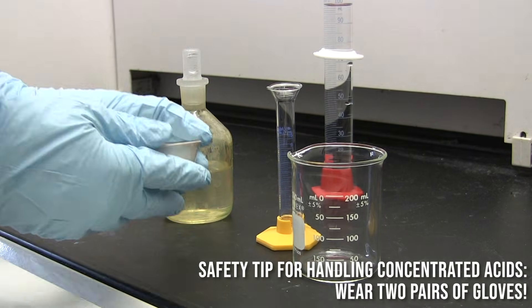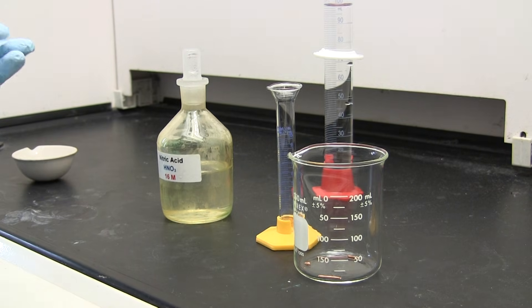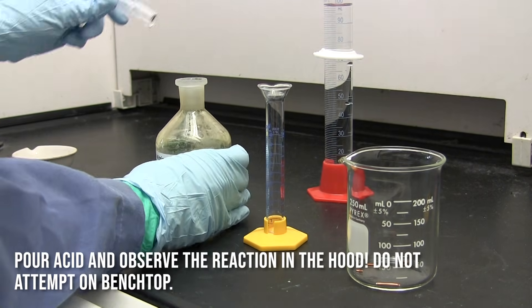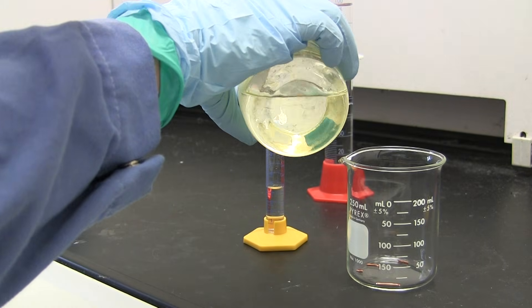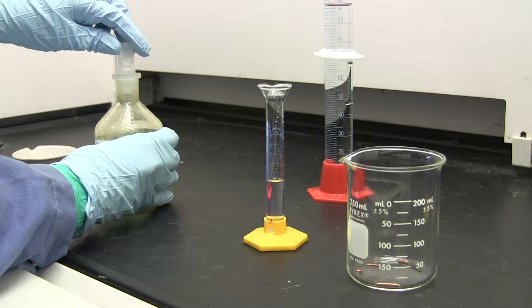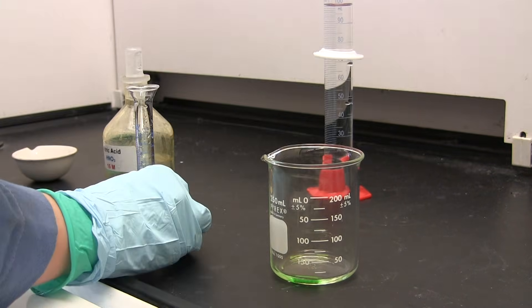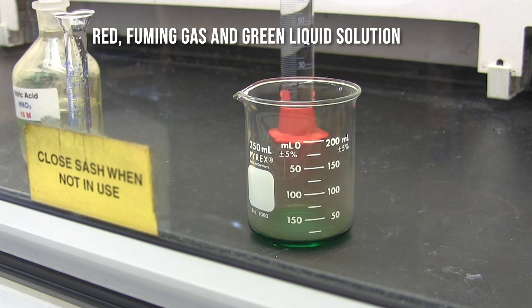I'm putting on two layers of gloves, just in case I get any nitric acid on my hands — I can take off the top layer and not worry about the acid seeping through to my skin. I added the copper to a 250 ml beaker and measured out 5 ml of concentrated nitric acid, then added it to the beaker. I closed the hood because there is a red fuming gas coming from the reaction. As you can see, the liquid has turned green and there is a red gas evolving.